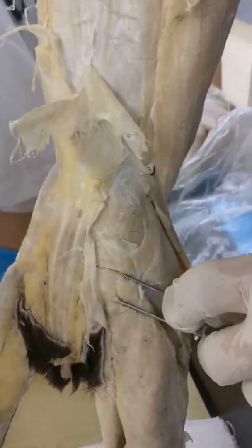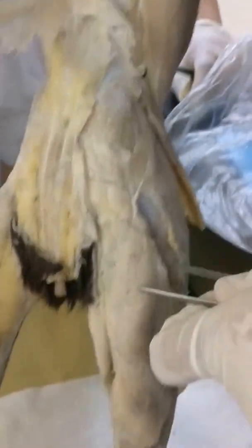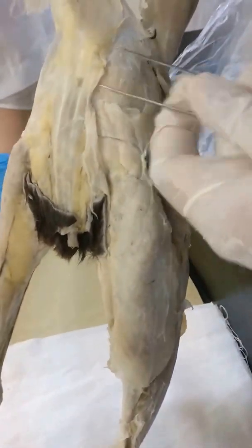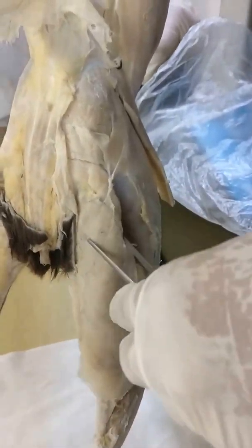This is the gluteus maximus. And this is the codo femoralis. Then this big muscle here is the biceps femoris. So: gluteus medius, gluteus maximus, codo femoralis, and the biceps femoris.